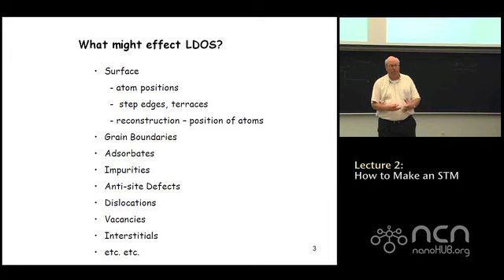So if you have, let's say, a metal and you have an impurity atom buried in the metal, the electrons in the metal quickly screen that impurity out. And over a couple of lattice constants, you wouldn't be able to tell the difference. But for materials like semiconductors, where the number of screening electrons is vastly reduced, you could in fact have subsurface impurities which mimic a perturbation in the local density of states, and in principle you could pick that up.